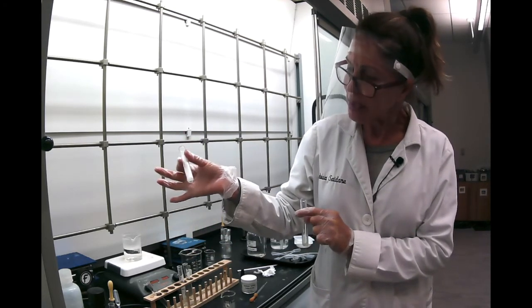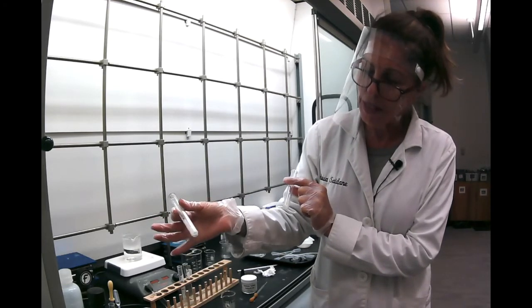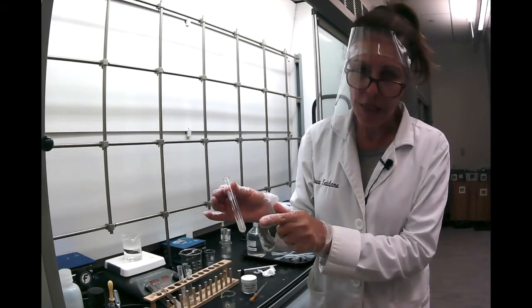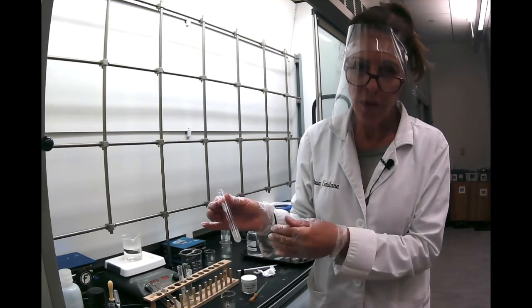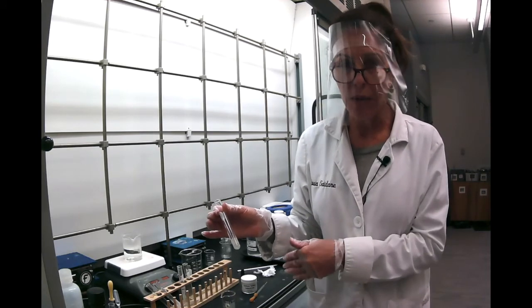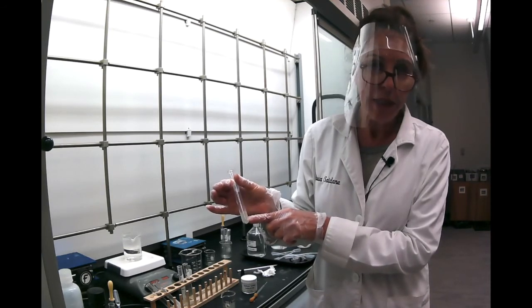So you can see by just visually, without even the masses, this definitely gave us more benzoic acid. This is the active extraction, meaning that we put the benzoic acid and we made it react with the sodium hydroxide. So what happened is the benzoic acid ended up in the aqueous layer, and that's the reason here in the organic layer we have very little left.